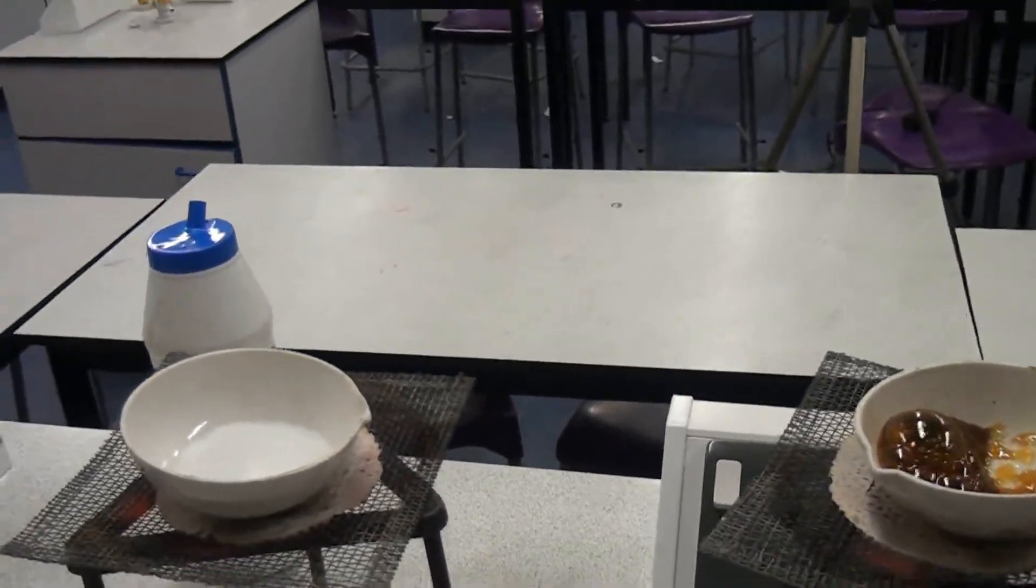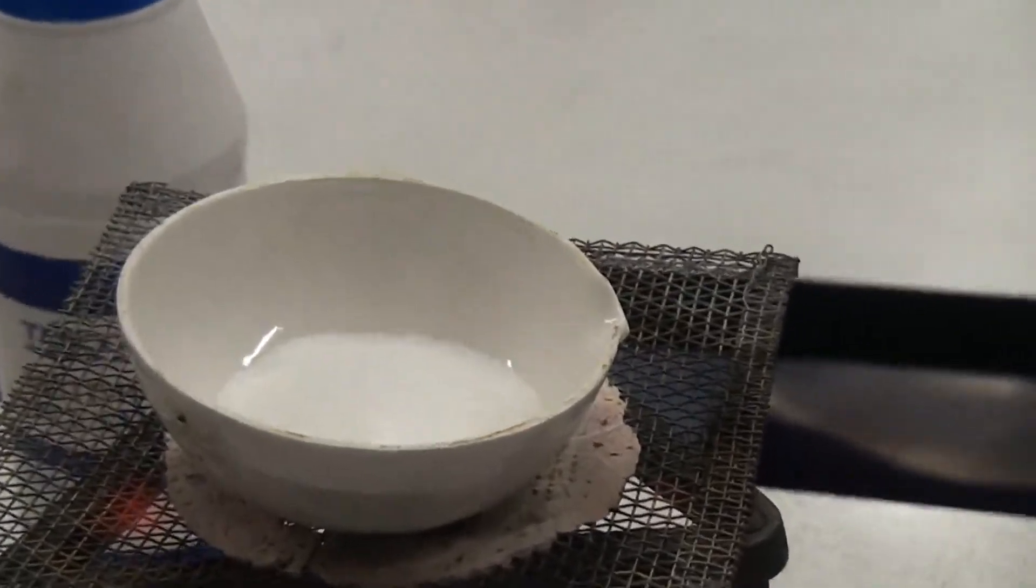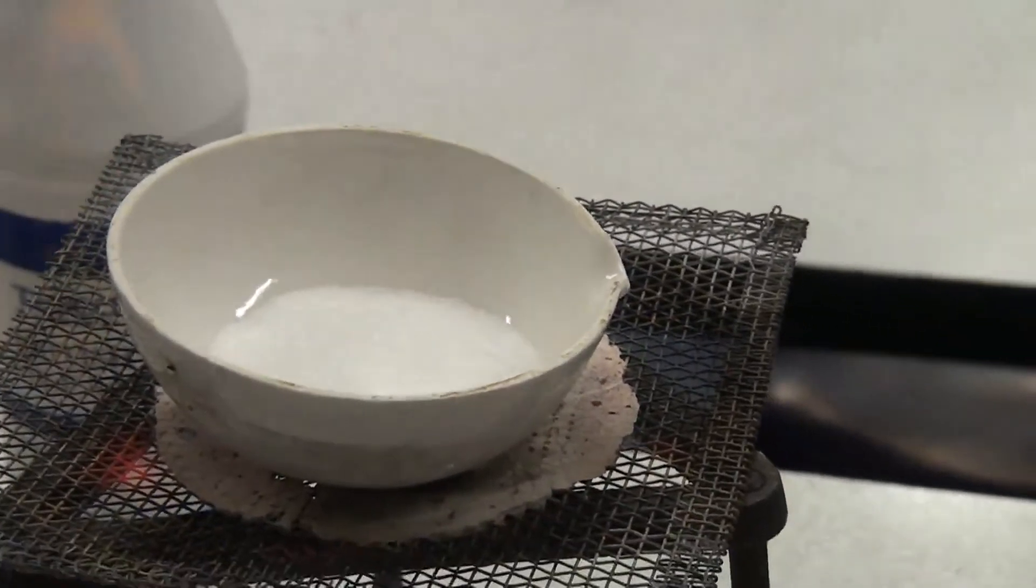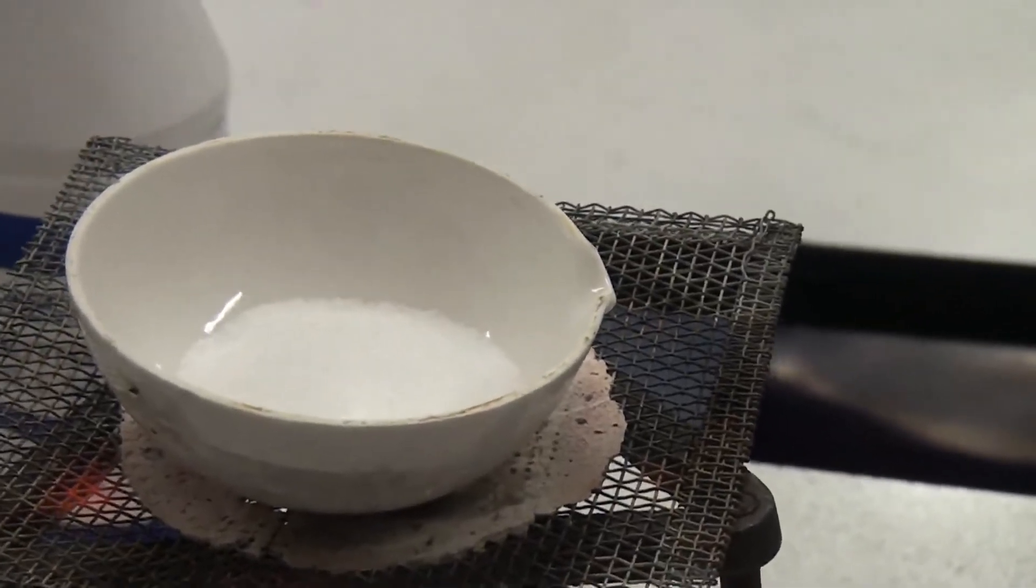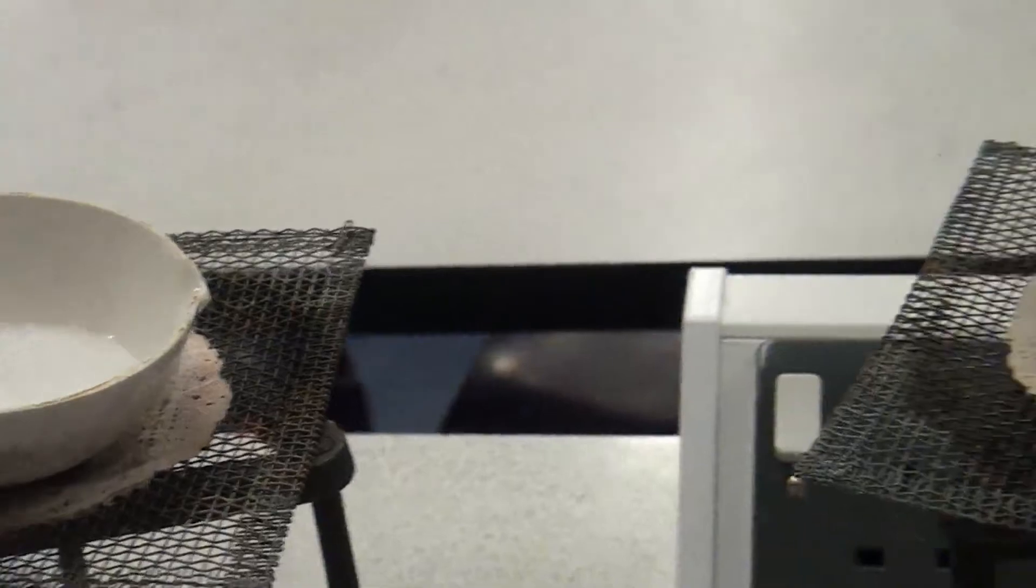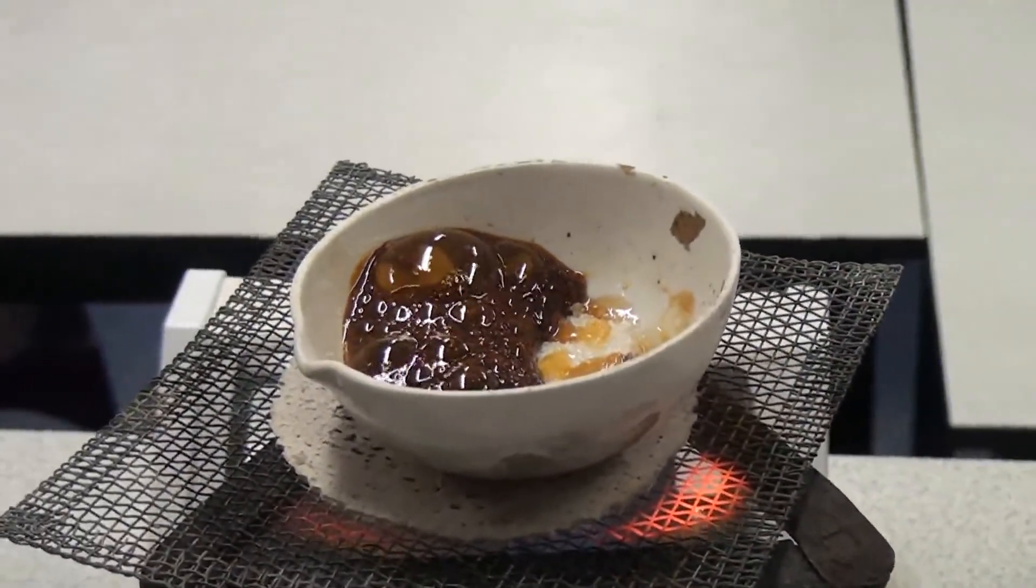So a few minutes in, we can see that the salt is unaffected because it's got a very high melting point. It's an ionic compound. So we could leave that on there all day and it's still not going to melt. The sugar, although it looks very similar to salt, is melting quite easily just after a few minutes.